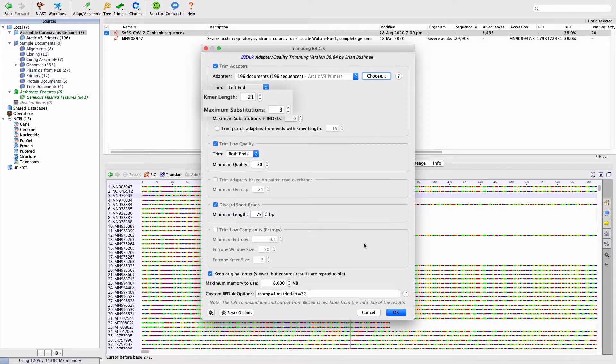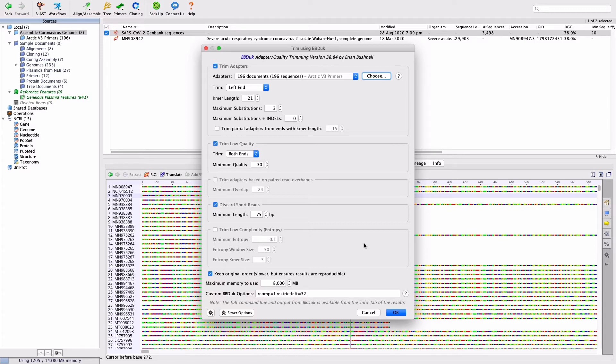Adjust the k-mer length and maximum substitution settings as shown on the screen. To ensure only forward-facing primers at the start of the read are trimmed, add the following custom commands under More Options: rcomp equals F and restrict left equals 32.